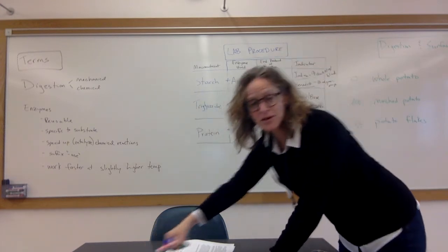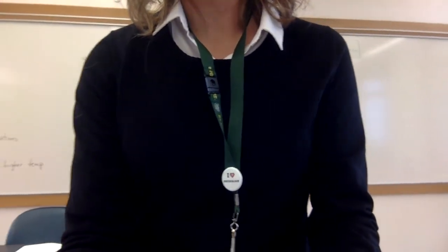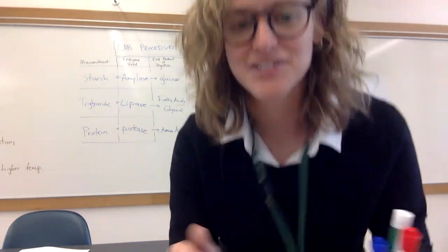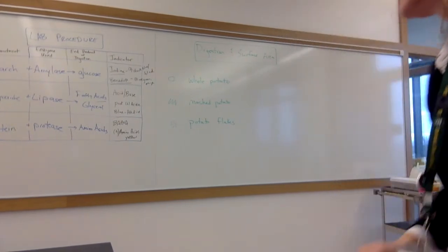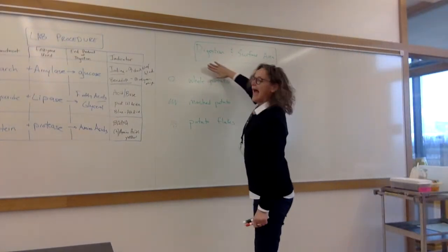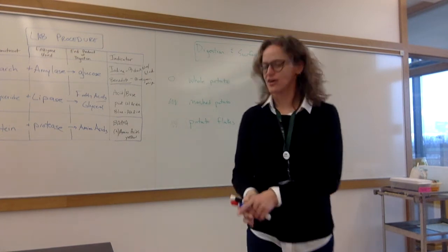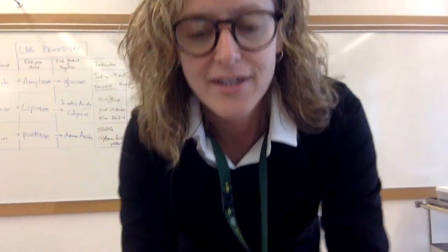Okay, last part of the lab. Here we go. Let's switch it over this way. Move it over this way. Oh yeah, the fun continues. Saw my pin, right? I love physiology. It's true, it's true. Okay, so the last thing we looked at in this lab is how digestion is influenced by surface area. This is kind of hard to see. Let me move this over. We're just going to make it work. The benefit is if you were asleep during this video, now you're awake.